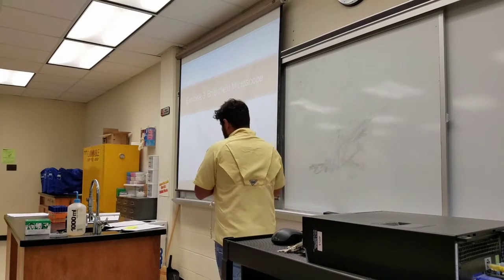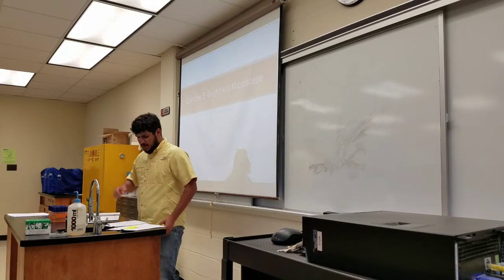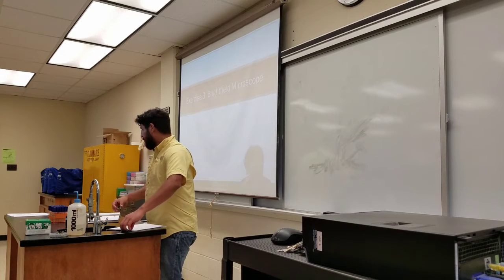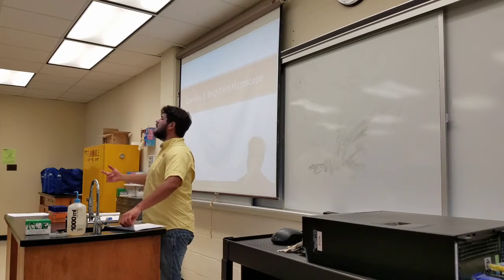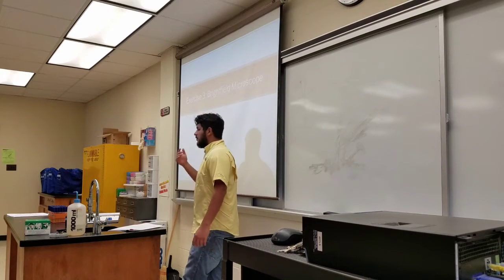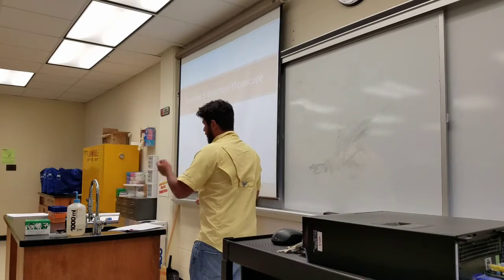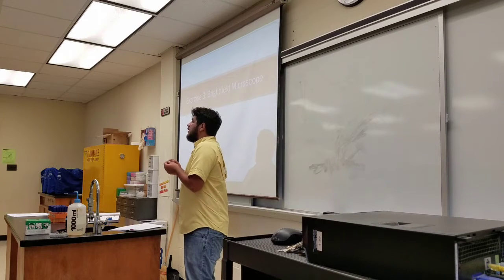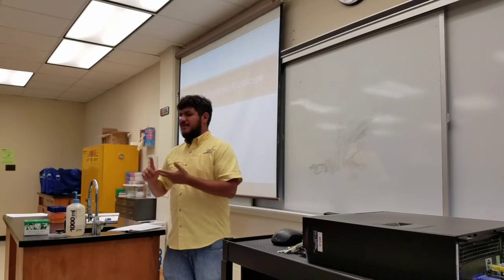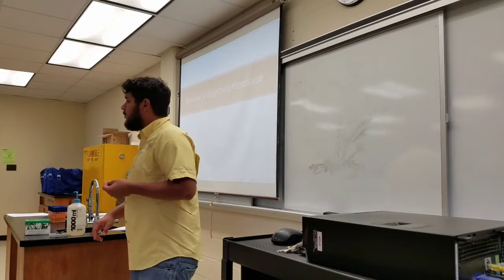So bright field microscope or bright field microscopy, that's what we left last lab. And so what we learn in streaking for isolation and the aseptic technique of going from a slant to slant, a plate to a plate, will be very useful. And actually, when we want to identify microorganisms, later on we'll learn that we can do some of the steps of ID, be it metabolic tests and all that, where we will use aseptic technique. However, something that is also really useful is being able to see microorganisms.